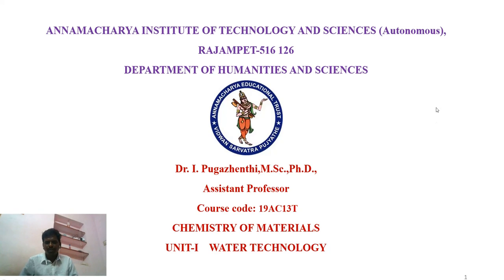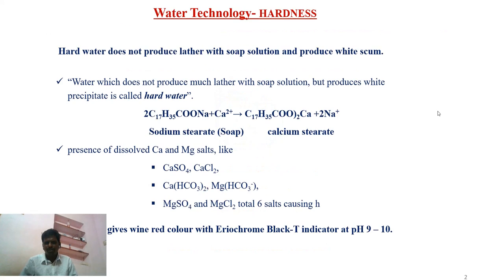Hi to everyone. In this session, we have to discuss hardness of water, types of hardness, and estimation of hardness by the EDTA method. These are the topics to be discussed in this session. We have to see one by one. So, the first one is hardness.